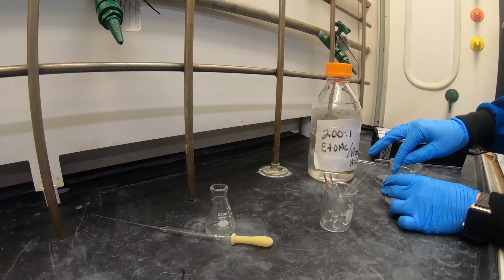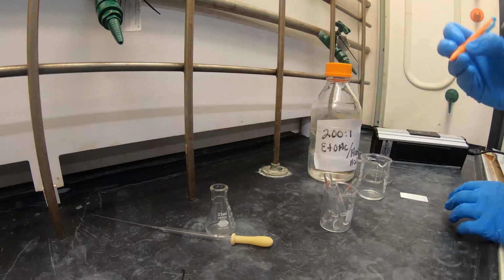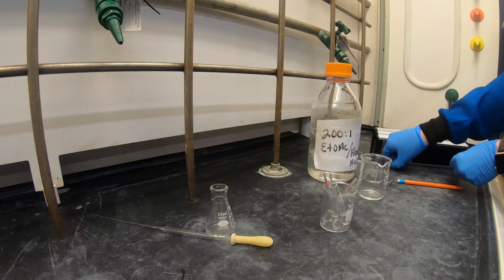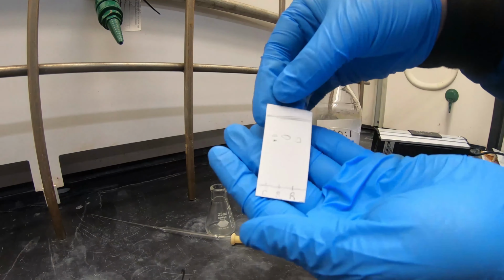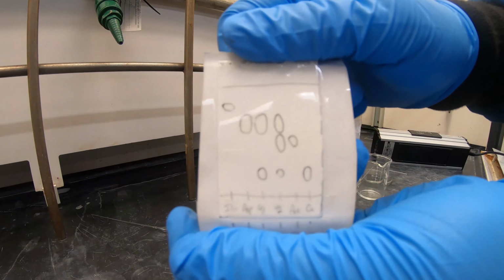Put the watch glass on top and let the solvent run up the plate until it's 3/4 of the way up. Then remove the plate from the chamber. Mark the solvent line immediately using a pencil. Once the plate is dry, place it under your UV light and circle any spots that appear. You will also run a second plate of standards against your aspirin. Draw both TLC plate results in your notebook.